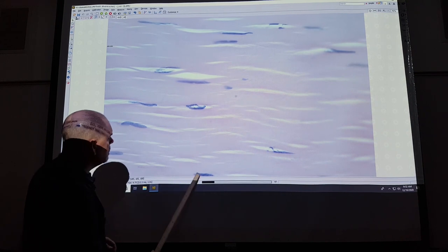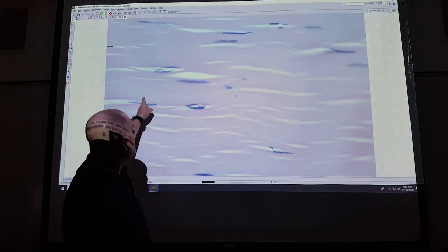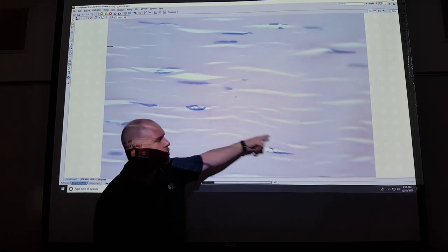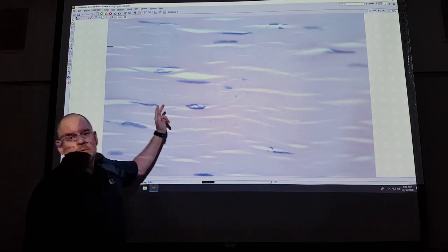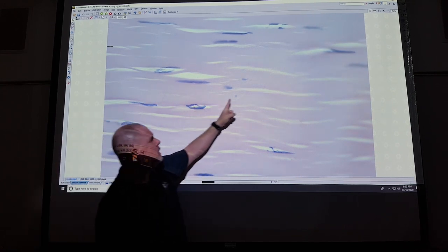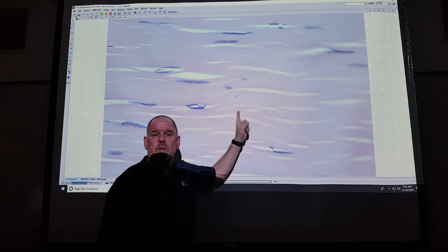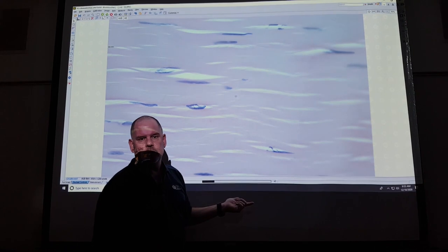These are the cells, the fibroblasts and fibrocytes that made these fibers. These pinkish red things are collagen fibers, all essentially running in the same direction. Now, when you look at this tissue, it would be not unheard of for a person to confuse this tissue with one that we saw in our first lab, skeletal muscle.